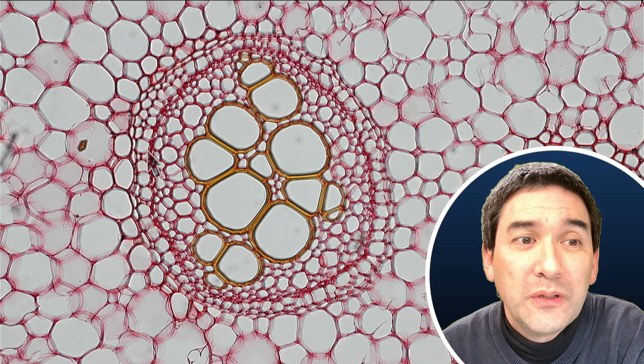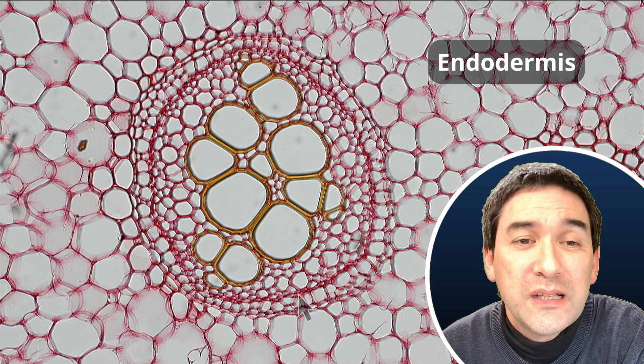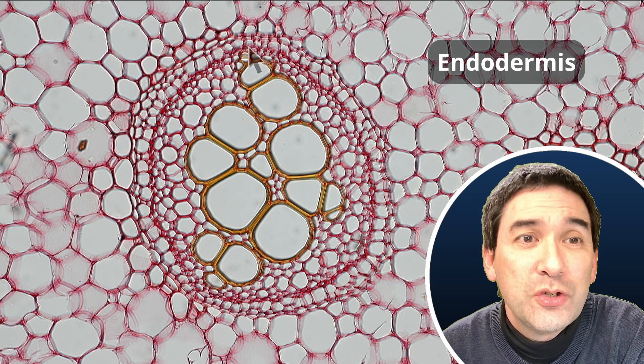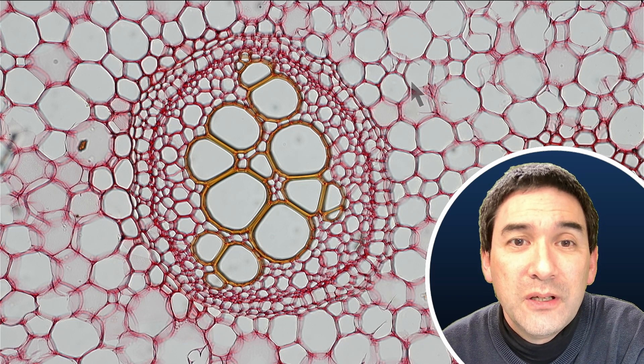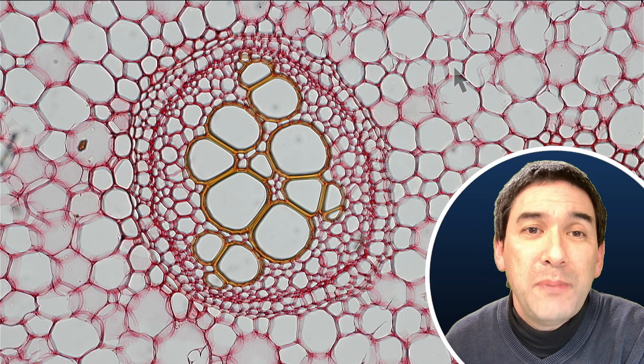You have on the outside here the so-called endodermis, which is a layer of cells that essentially also surrounds these vascular cells here. And then here you have other cells of the stem. And this is a basic structure that is kind of repeating all over the place here. You can see it over here as well. And I think this is a very pretty specimen here.